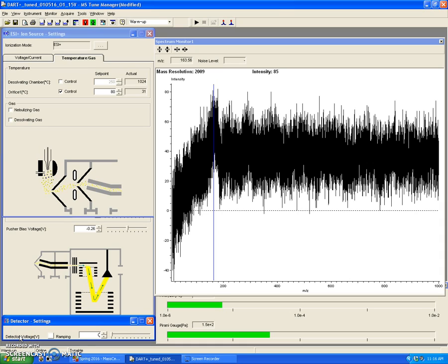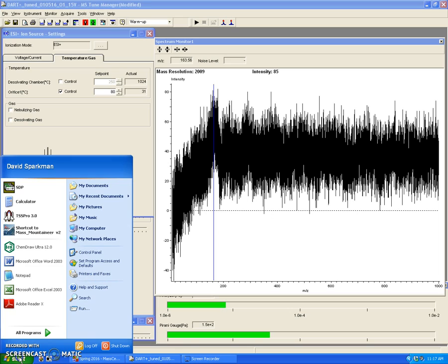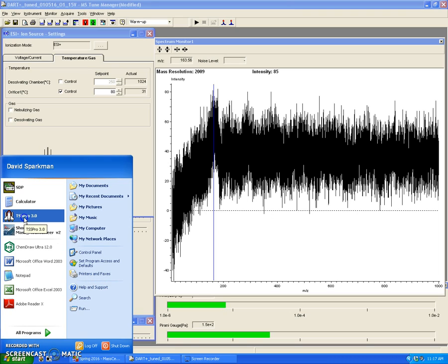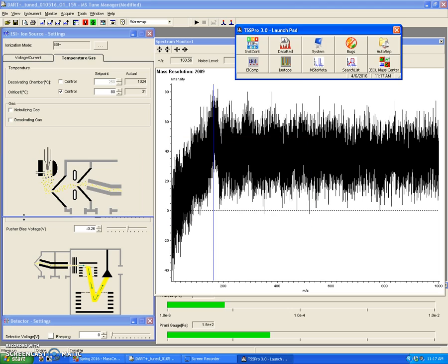Once you're ready to do your data analysis, what you're going to have to do is open your JEOL AccuTOF data file into a third-party software program. This can be done by going to Start, TSS Pro, this rocket ship right here.